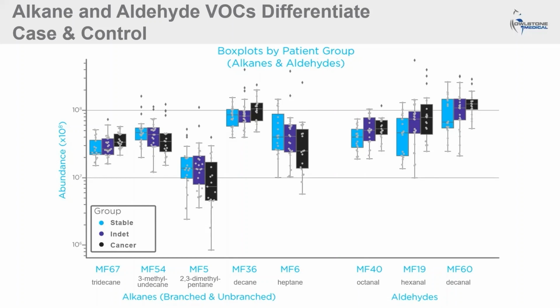At this time, it's difficult to assess the biological impact of the differential changes in direction of the alkanes in this study. However, the results may reflect differentially located changes in oxidative stress and lipid peroxidation, or perhaps changes related to specific patterns of unsaturated fatty acids.